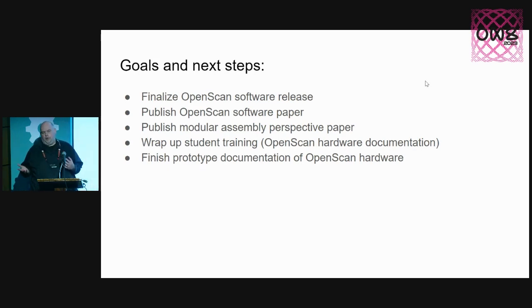And we like to think we were doing open hardware because we'd released the plans for our microscopes, but we really realized we weren't. That just putting something in a PDF and saying, hey, we built this, here you go, is not open. And part of the reason we realized that is my lab is all student-based. And many people, some great scientists like Mark Tsuda here, who was on my thank you slide as well, work on this work, but they graduate, they leave, and there's changes. So if you look at those 6 earlier pictures, we went back to try to document with this visiting student from India what was going on. We realized in our own lab, we couldn't reproduce it, right?